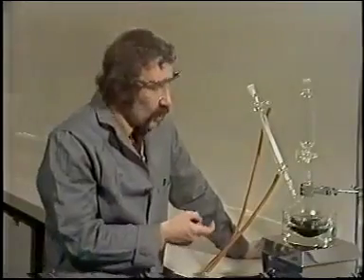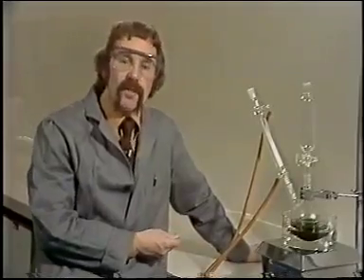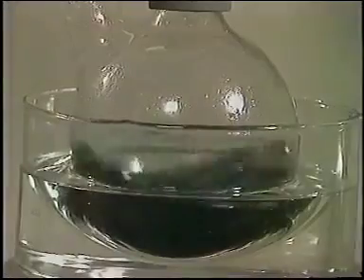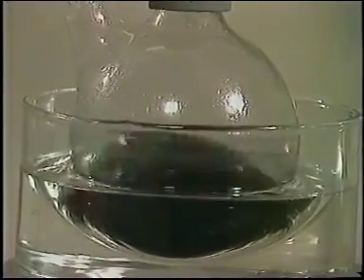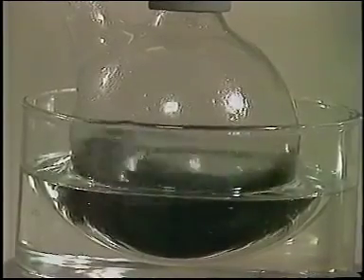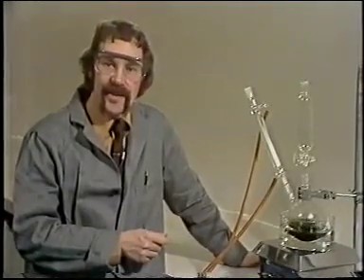In the flask, we do not have the reaction product. We have a reaction mixture. As well as the product, it may contain unreacted starting material, the inorganic reagents which were used in the reaction, and the solvent. So how does the organic chemist set about separating the product from the reaction mixture?